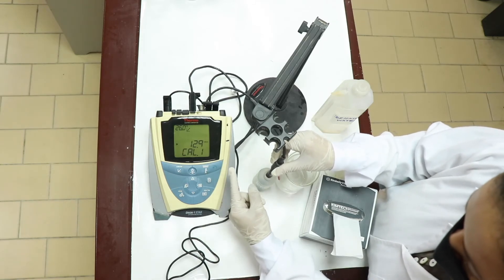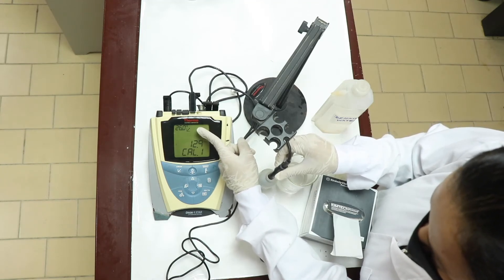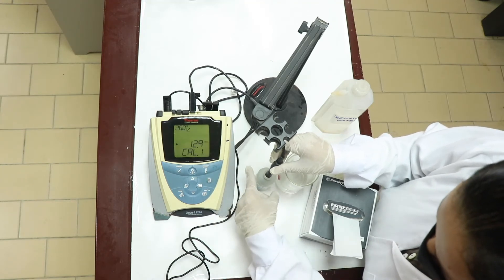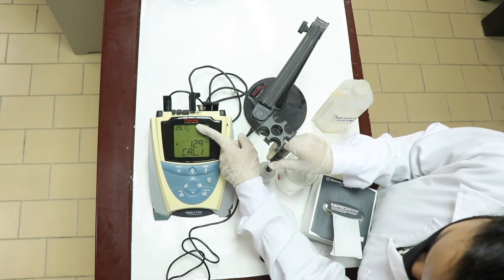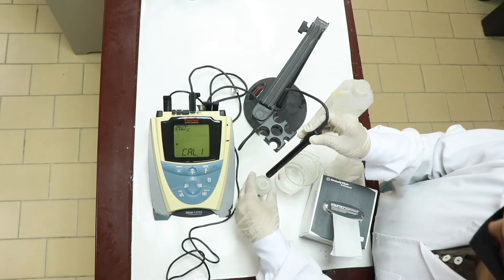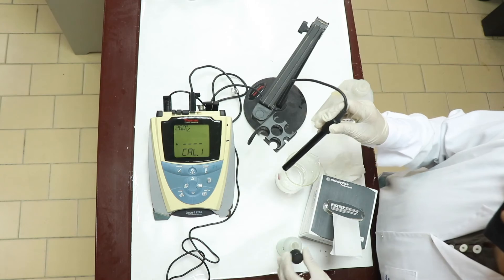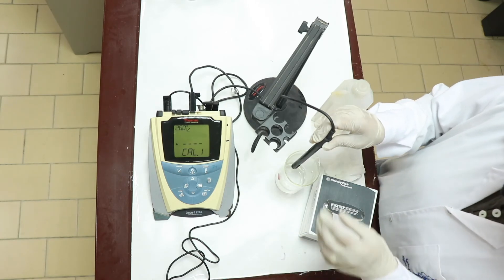Also, you have to note that conductivity is always temperature dependent. You have to note the temperature, the performing temperature what is appearing on the screen. Always note down the temperature. The step of calibrating the instrument is over. We can just wash the electrode again. Pat dry.